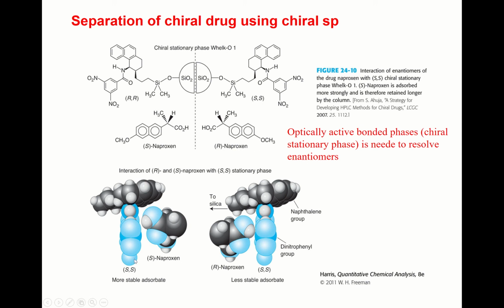Now this is a model. This is a naphthalene group, naphthalene here. And this is a dinitrophenyl group. This is the bonded phase.